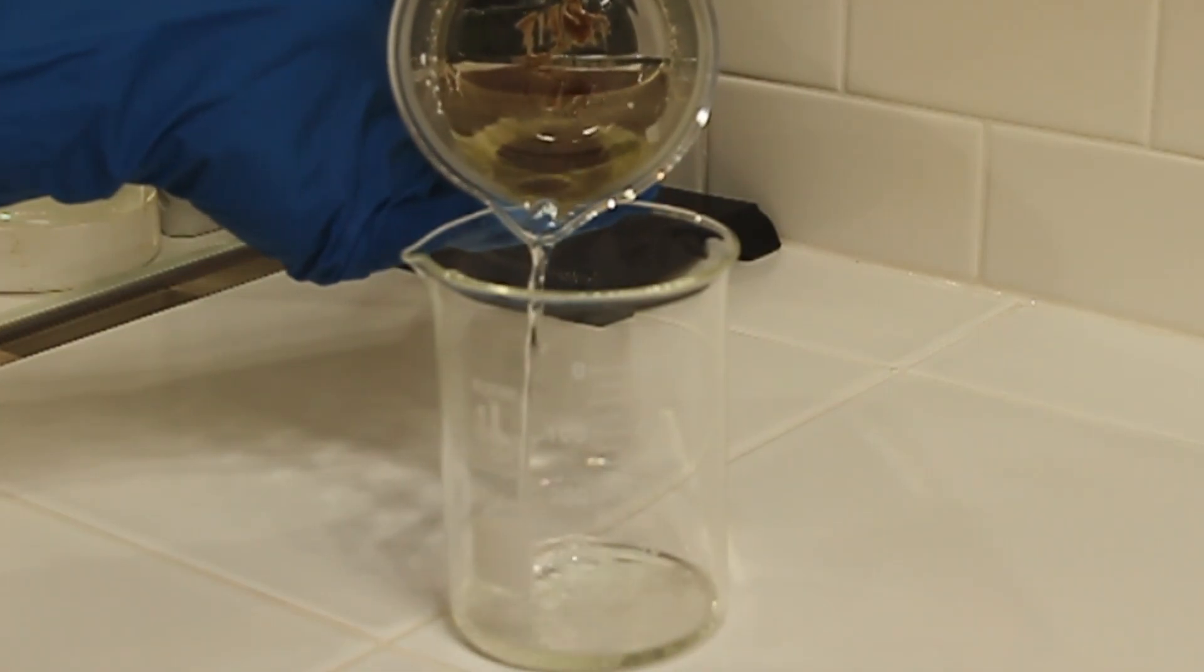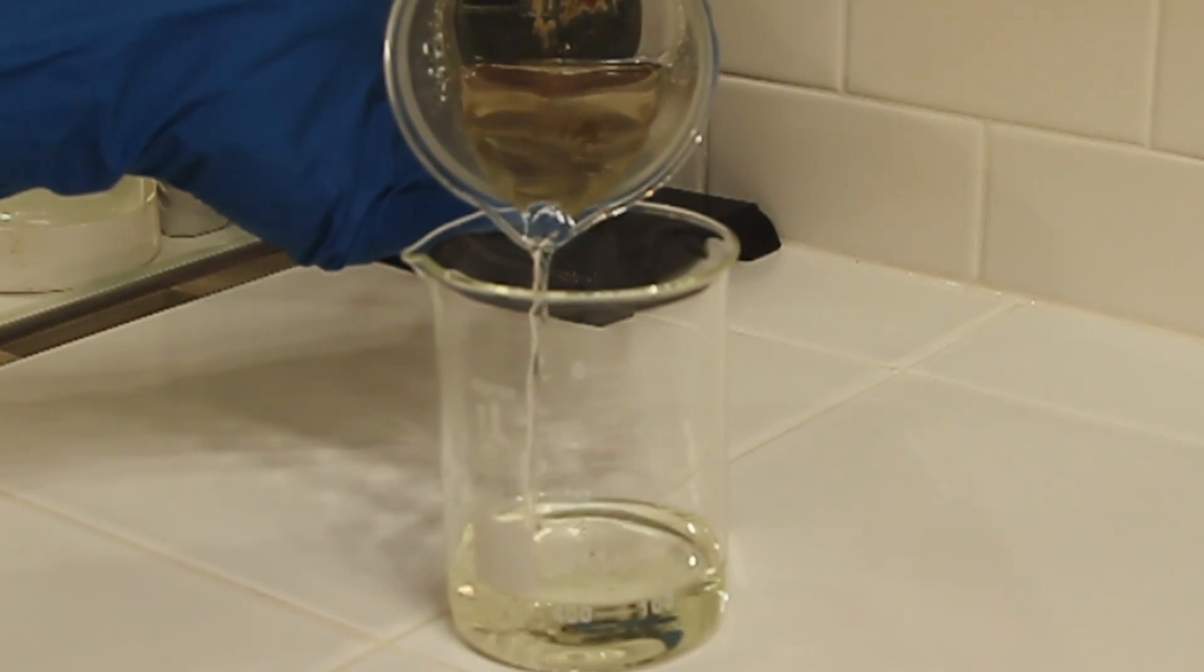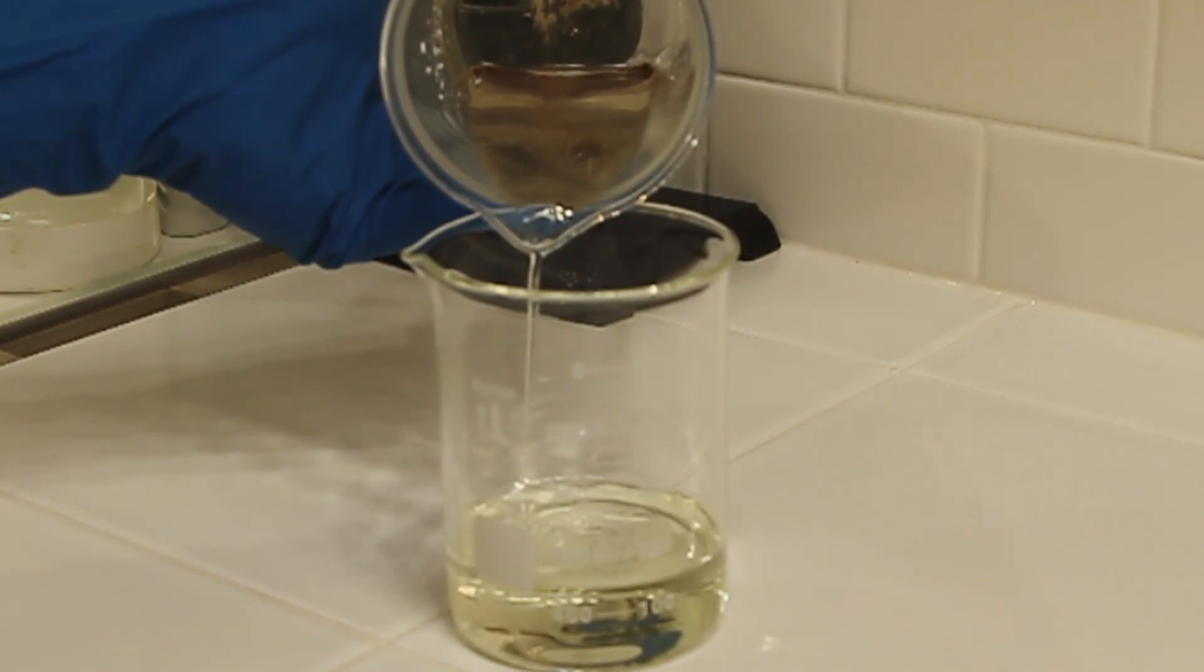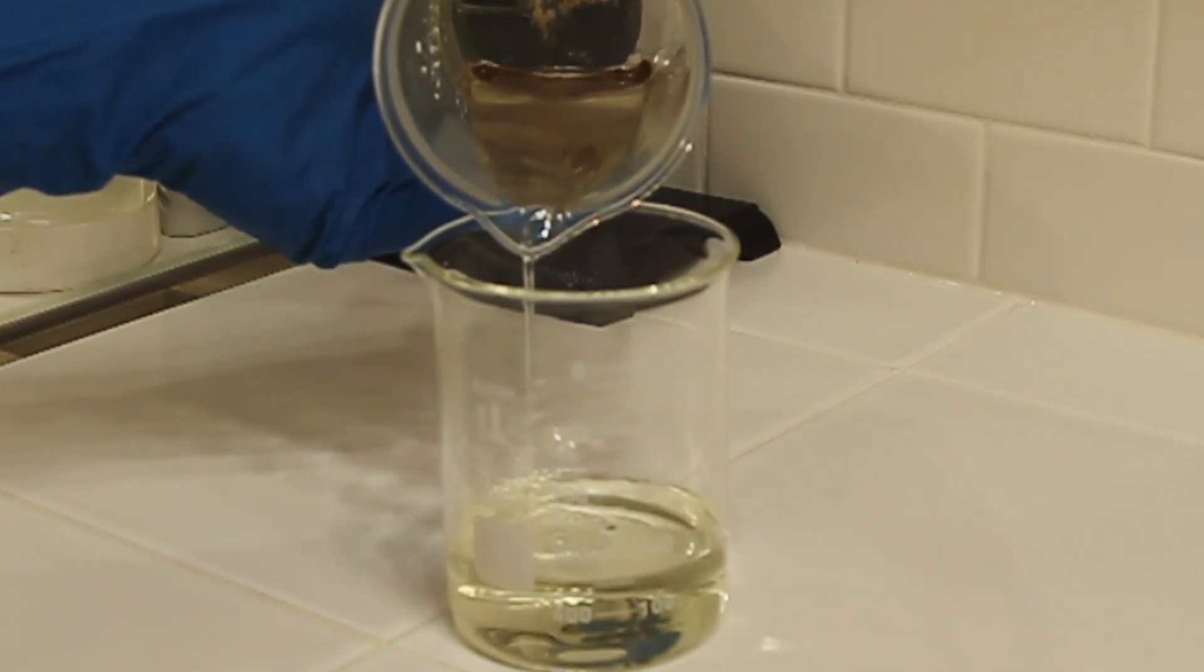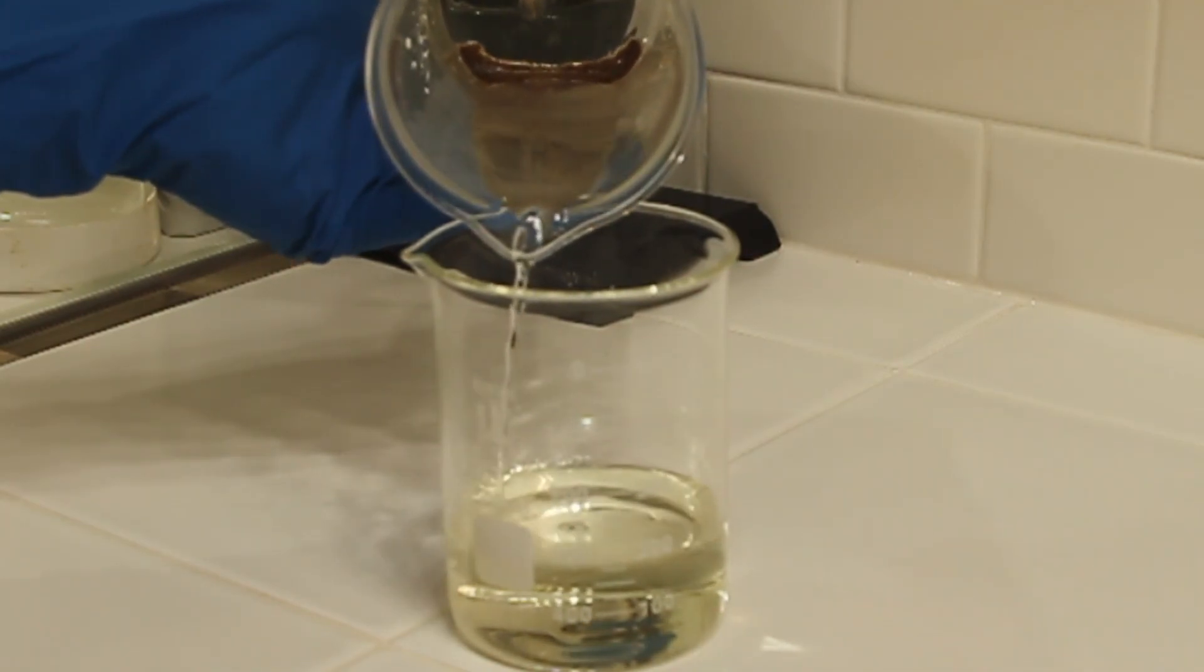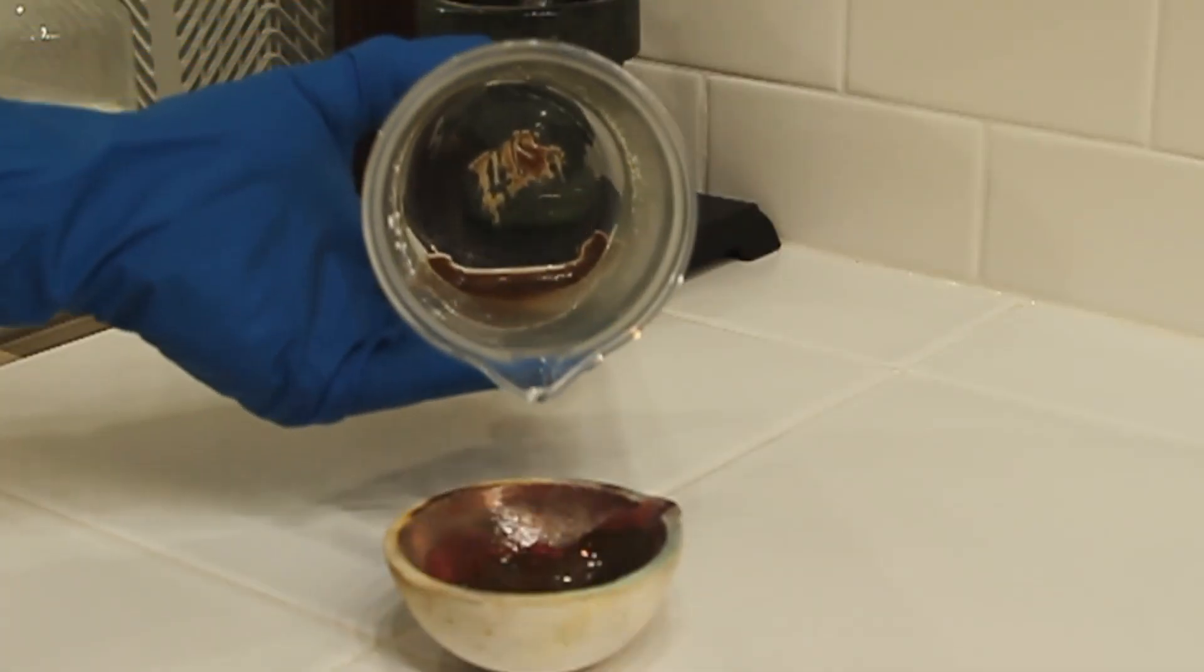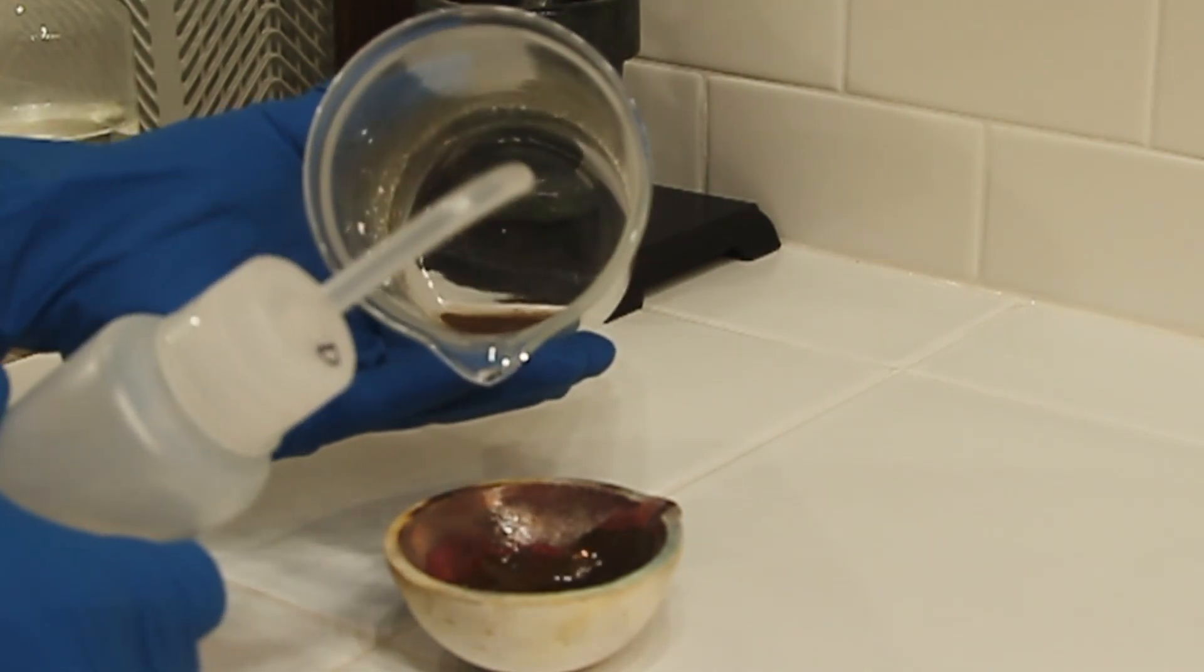So now we're going to pour off the excess. I'll just pour this off kind of slow so we don't get too much of the gold transferred over into the dish here. Once we get this poured off, then we're going to take the solids out and transfer those into a crucible.